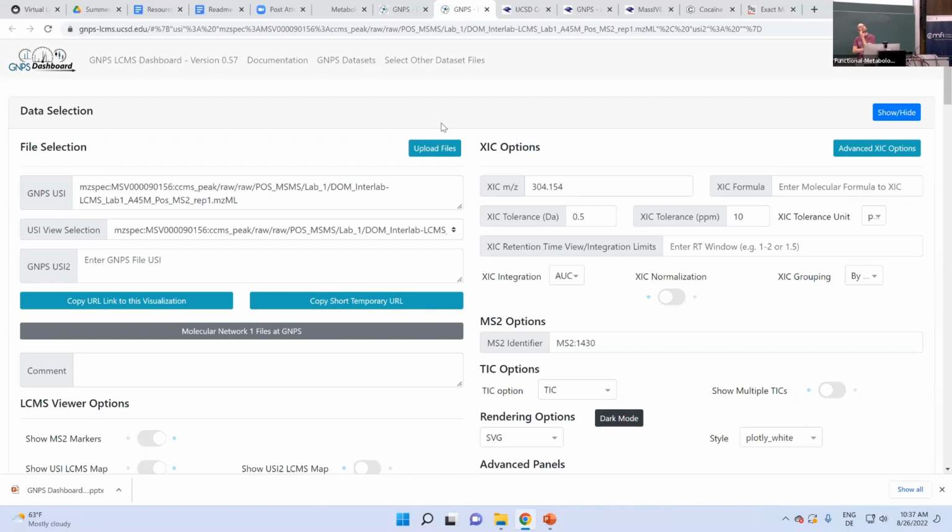I know there's a good reason for that, but do you think they will do something? Yeah, so for MassIVE, you can upload any mzML or any XML file. So this can be direct infusion stuff. This can be single scans from, I don't know, average top-down spectra whatsoever. I would assume that as soon as this is mzML file format, you can also visualize it here. So if you do flow injection analysis and you have, I don't know, 10-second acquisitions, it will just display it as a chromatogram, right? But obviously it's not a chromatogram. It's just the summed scans over the infusion time. So that should work here.